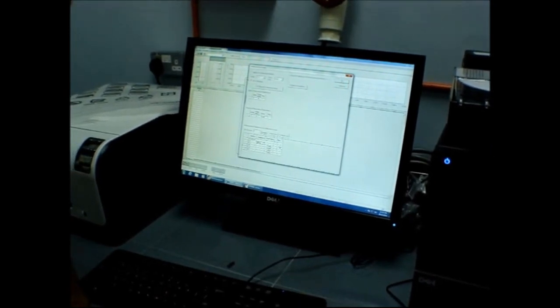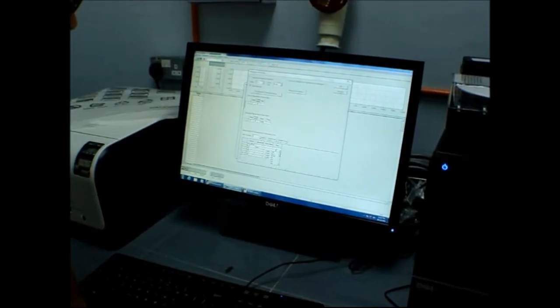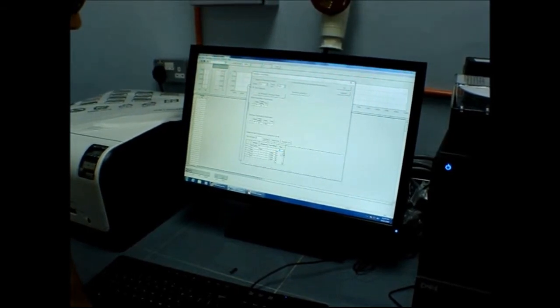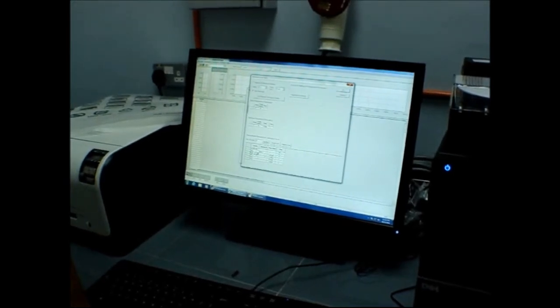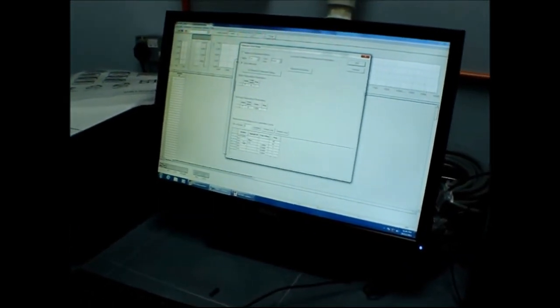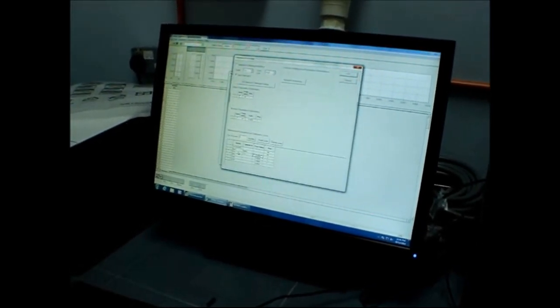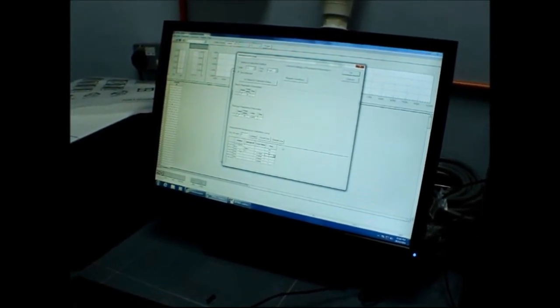So our position is R1. This is R0. The rest is standard. So this is what? 0.5? 0.1. Then through 0.1. So this is R2.